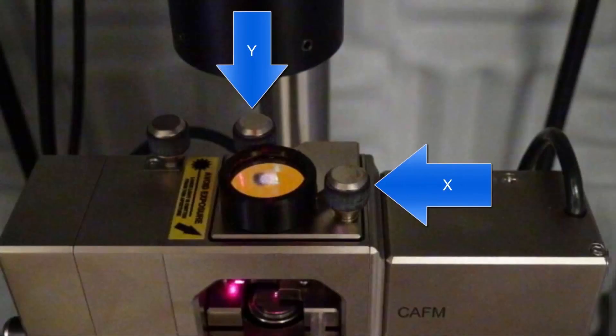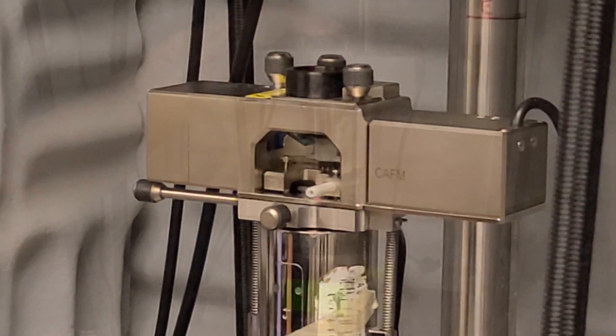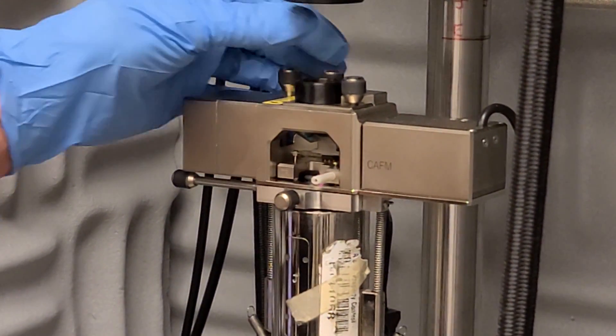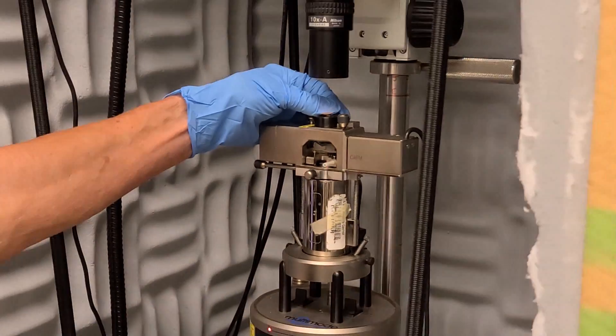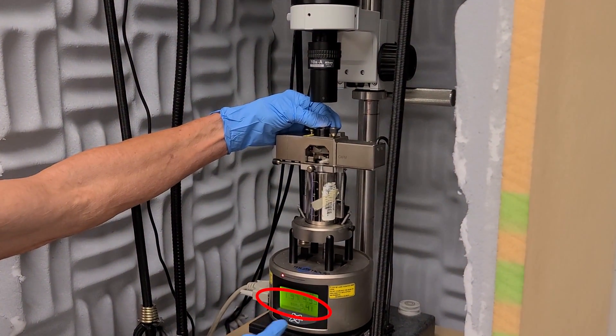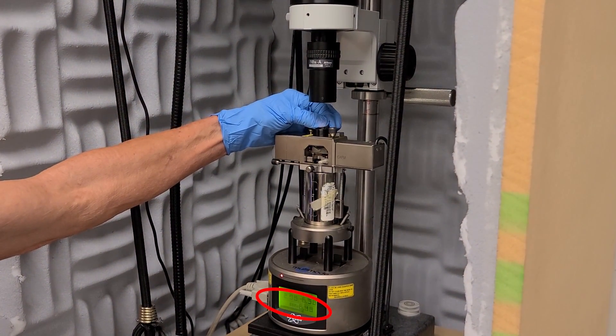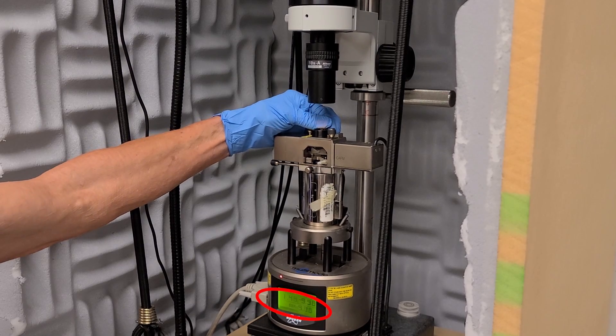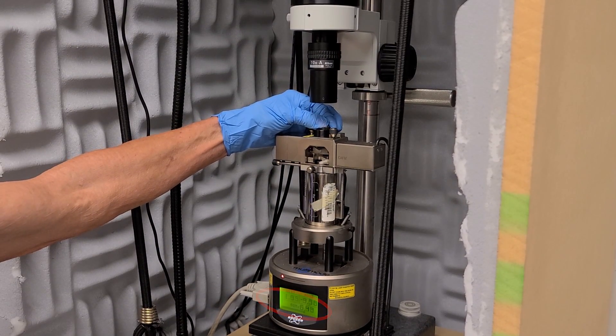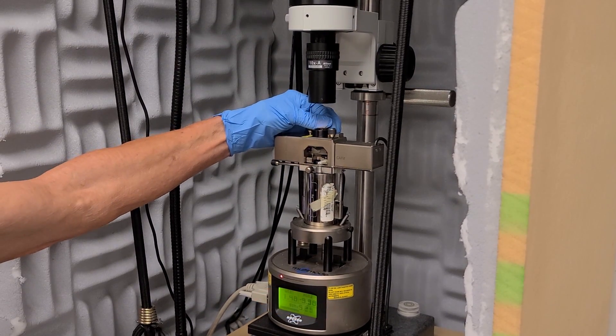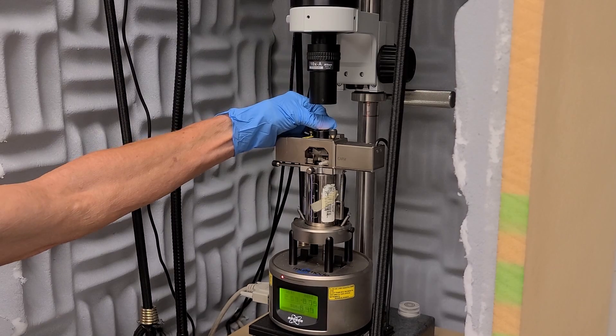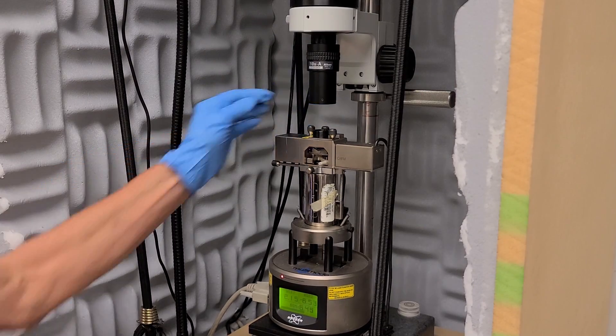Note the location of the XY laser positioning knobs. Start by moving Y slowly half a turn counterclockwise while observing the sum on the microscope display. If it does not increase, return to the start position and move Y half a turn clockwise. When you notice an increase in the sum, keep adjusting to maximize it.